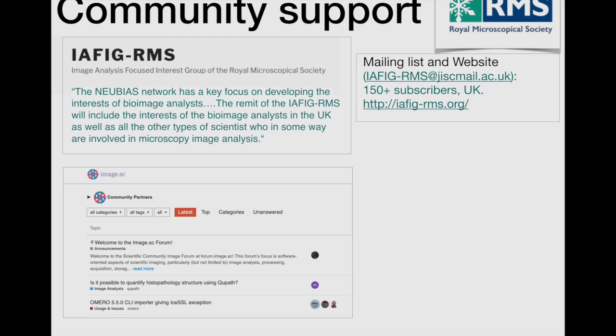And so that's the end of the slide-based bits. I'm going to do a practical demonstration now.